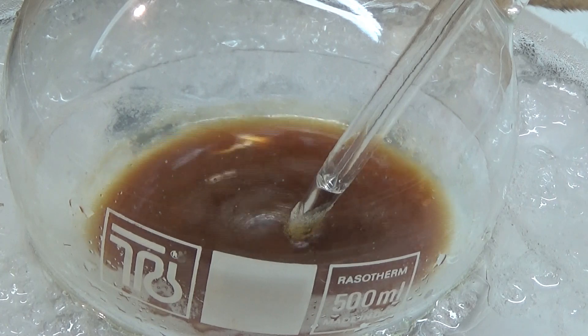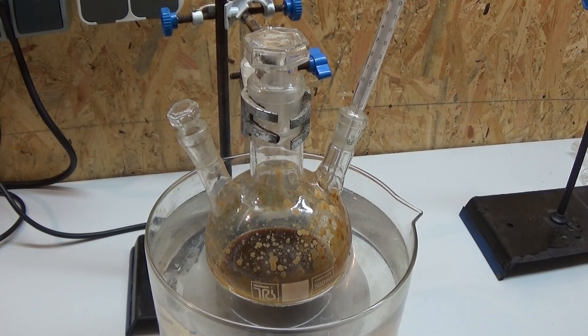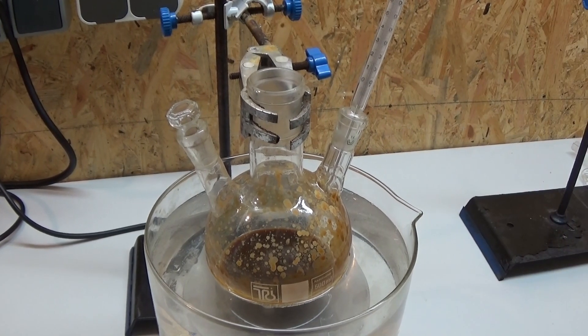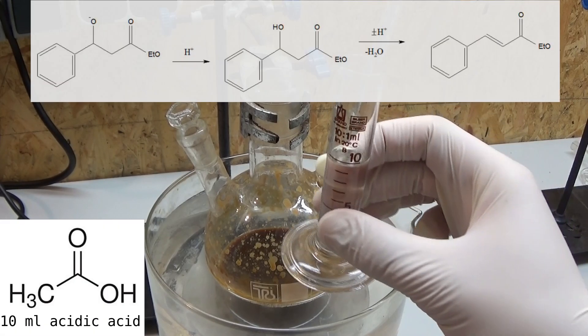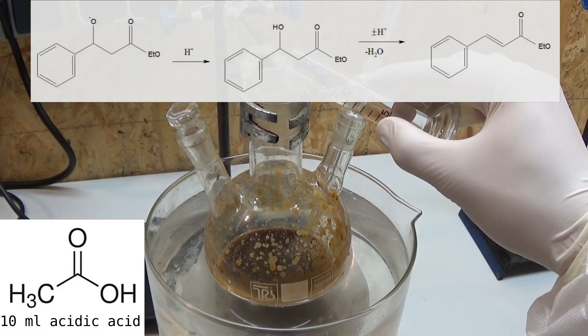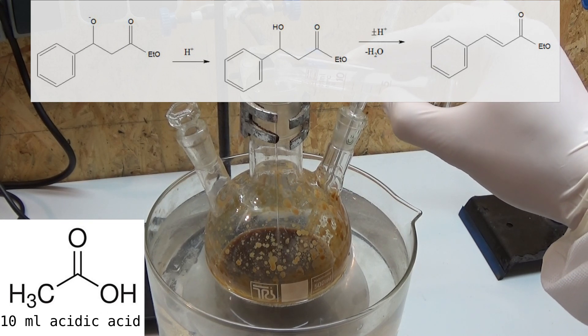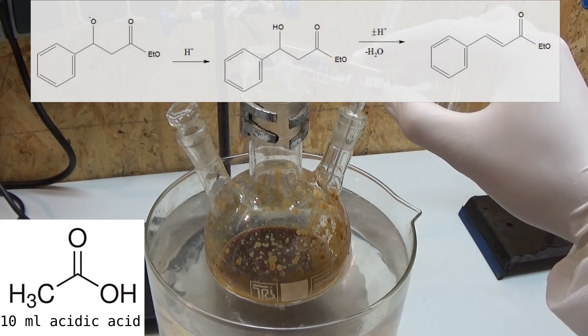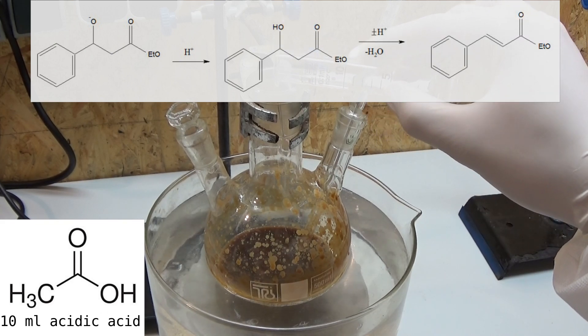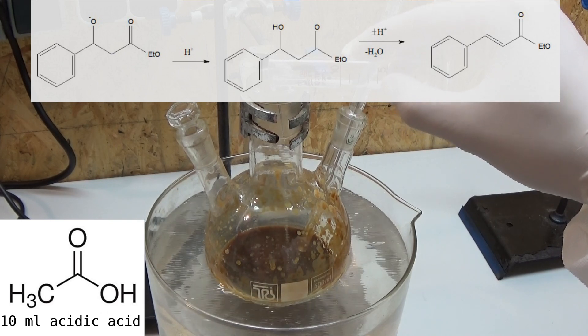When the addition is done it is stirred until all of the sodium is consumed. This is very important because we add water which could lead to an explosion. Now we add 10 milliliters of glacial acetic acid and stir the whole thing up. This protonates the secondary alkoxide yielding a hydroxy group. The hydroxy group then undergoes an acid-catalyzed thermal elimination of water and yields the ethyl ester of cinnamic acid.